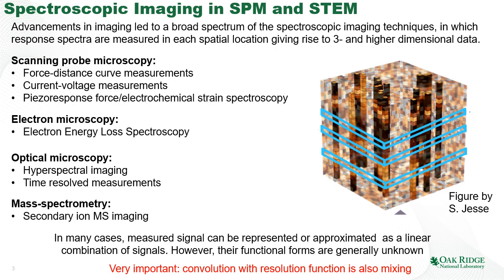So these are your three-dimensional data sets. Or you can measure more complex spectroscopy when you vary the time, voltage, and maybe other parameters, and then you can have four and higher dimensional data. For me personally, this was how we started to get into these multivariate methods.